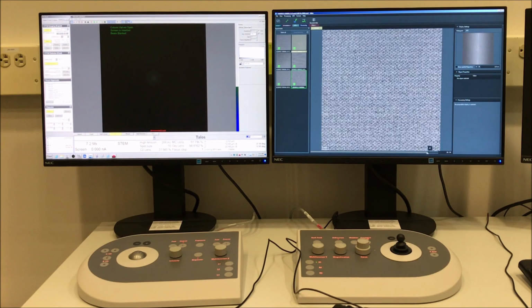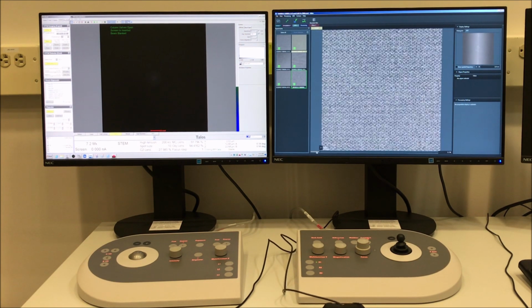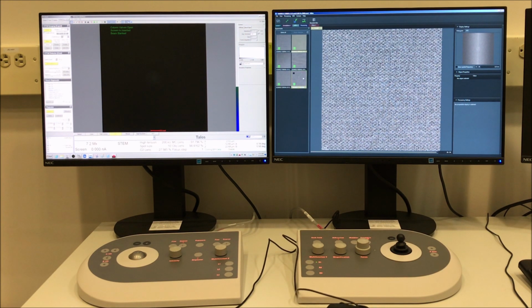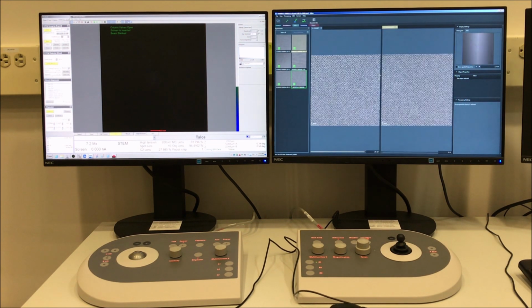You can select the series acquisition you just did, and then scroll through each image in the series here if you want. They all look pretty much the same. Then go processing, pull down, select DCFI. Make sure you select the option for periodic images, and then it will do the integration.